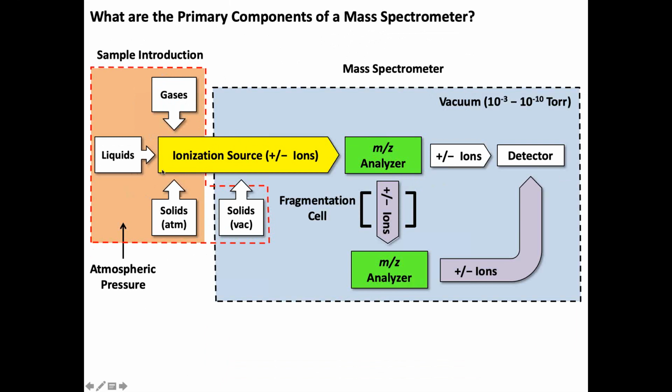It goes without saying, but I say it anyway, you can't analyze anything unless it has a charge on it. You have to ionize it. In the early days, the first 70 years or so, you were really restricted to things that were, say, less than 1,000 molecular weight. To get those to ionize, you had to derivatize them and make them more volatile.